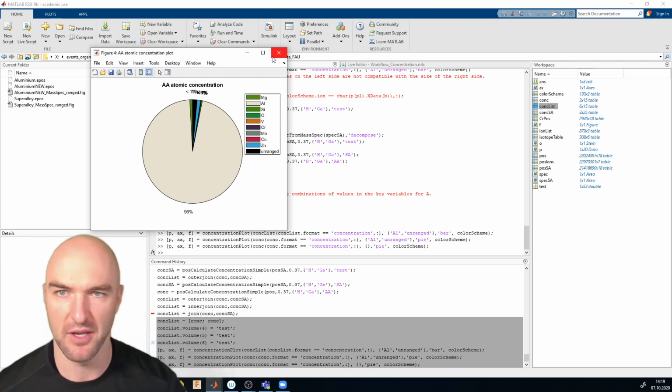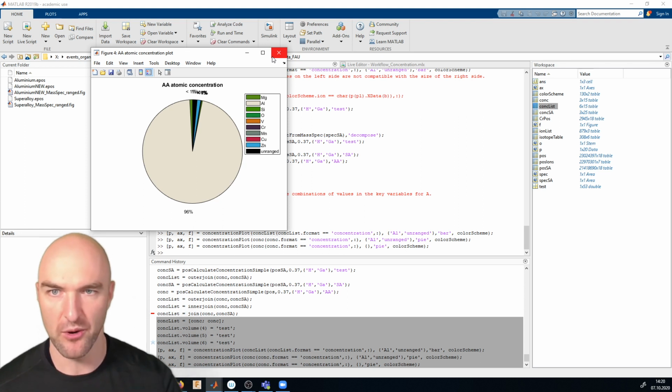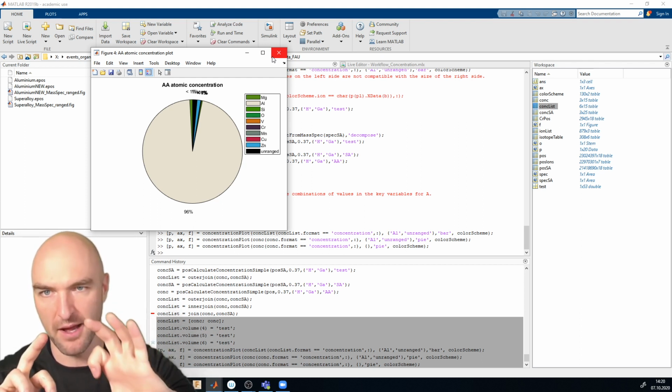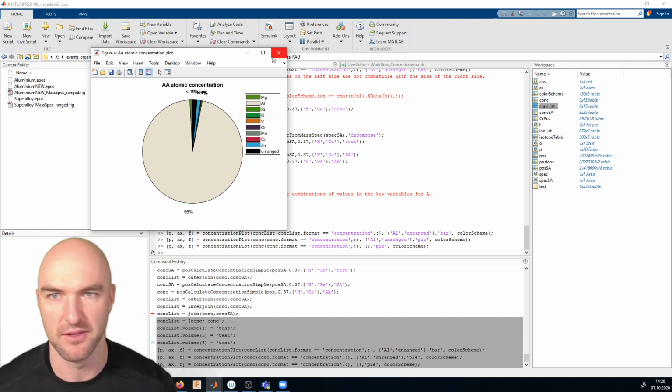For example, we had a data set where we wanted to see how much rare earth elements are in there compared to lithium, I think. So you have 1 bar where all the rare earth elements are stacked, and 1 bar with the lithium, things like that.